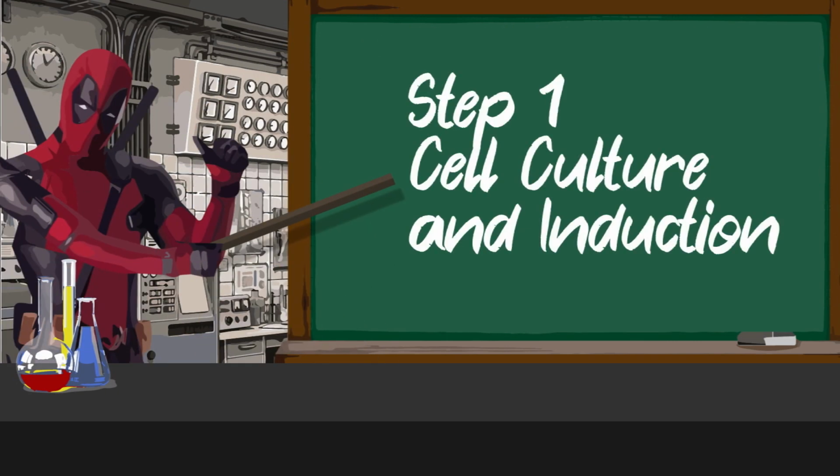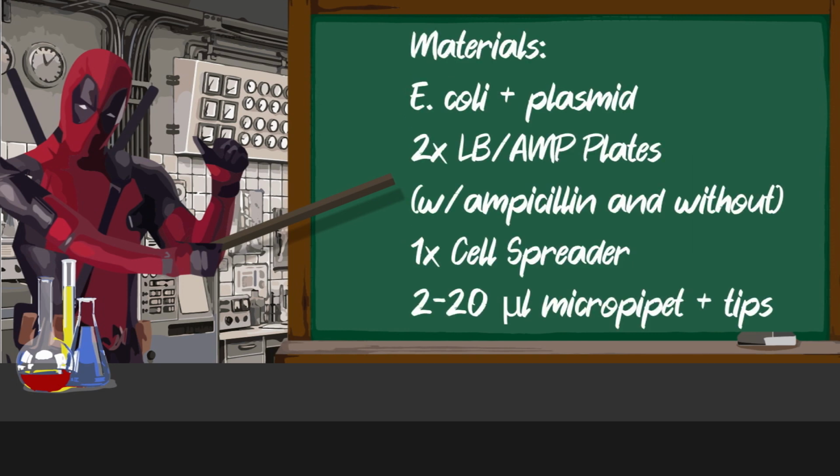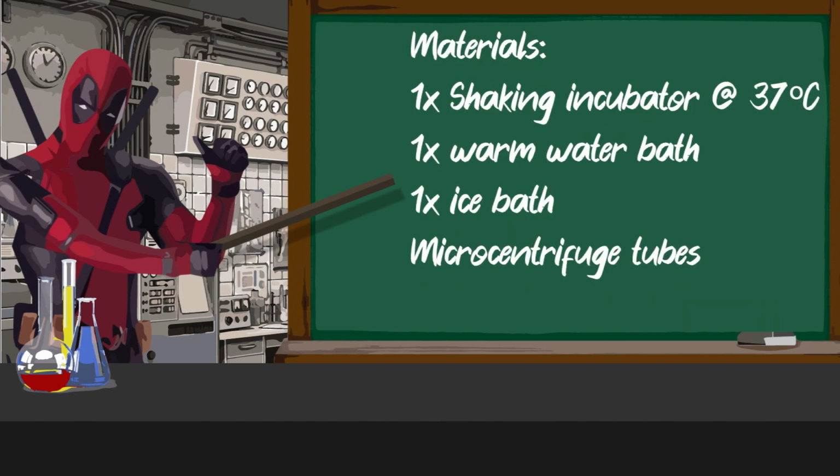The first step is cell culture and induction. The objective is to transform bacteria and select the transformed bacteria. In order to do so, you need the following materials: the E. coli, the plasmid, the LB plates, one that has ampicillin and one that doesn't, an LB broth, a cell spreader, a shaking incubator set at 37 degrees Celsius, a warm water bath, an ice bath, and microcentrifuge tubes.